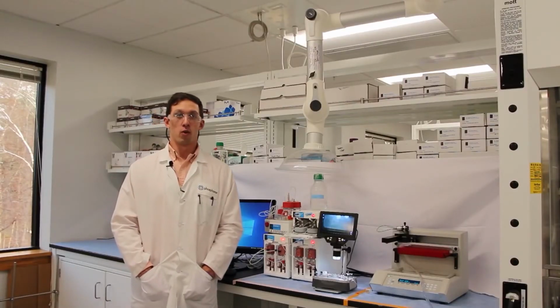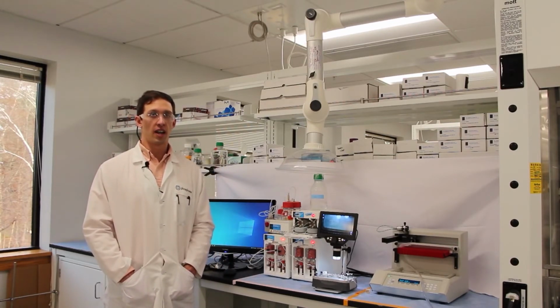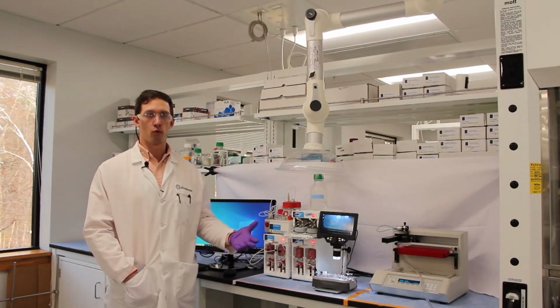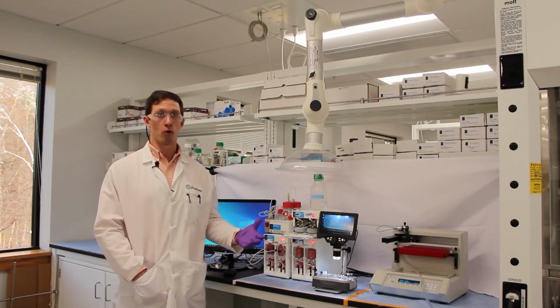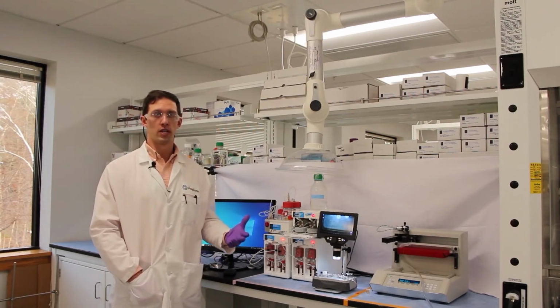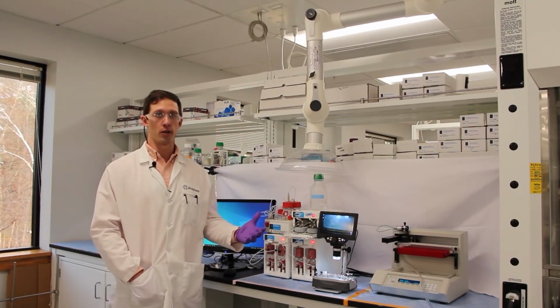Today, we'll be running through a quick demonstration using the Dolomite automated nanoparticle system to highlight how this system can quickly be used to scan and select manufacturing parameters to prepare lipid nanoparticles. In today's demo, we'll go over how to open the software, set up the instrument, set up an experimental table, and then lastly, how to process your sample upon manufacturing.